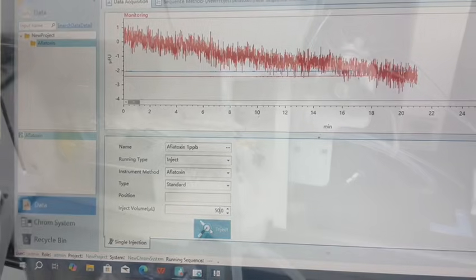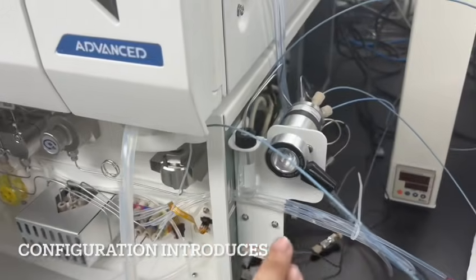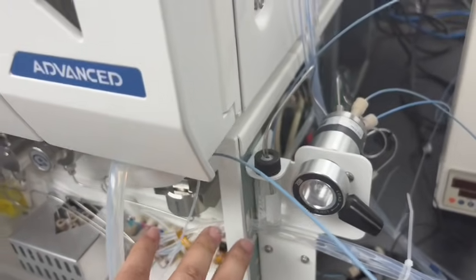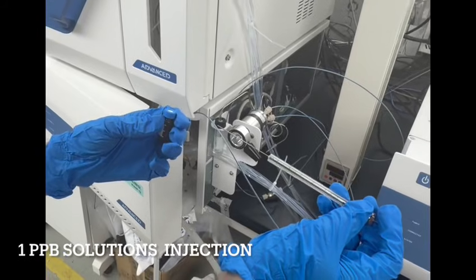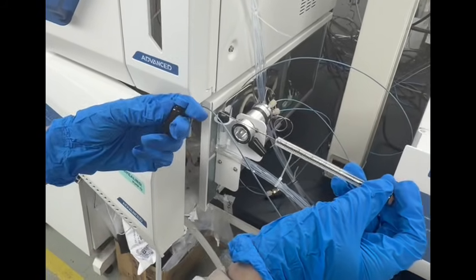Then we can see the pump, and also here is the manual injection. We put the injection attached by the side of the pump. And also you can see here is the column oven. Hello, Migo. Now we take off the sample and are ready for injection.